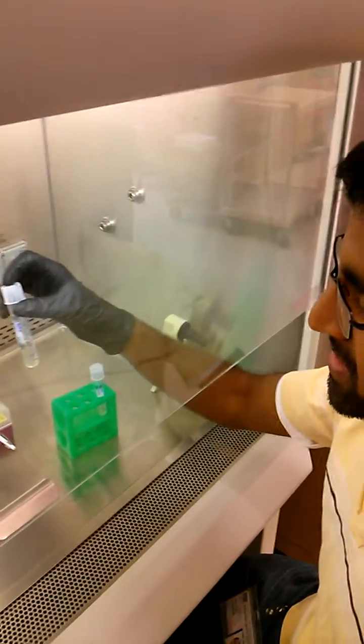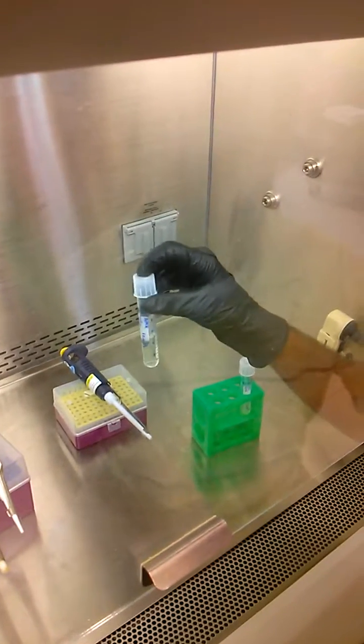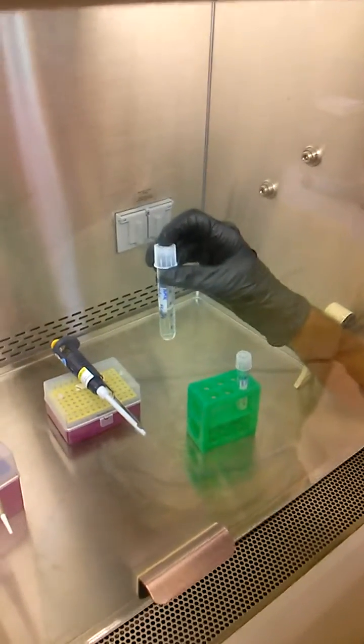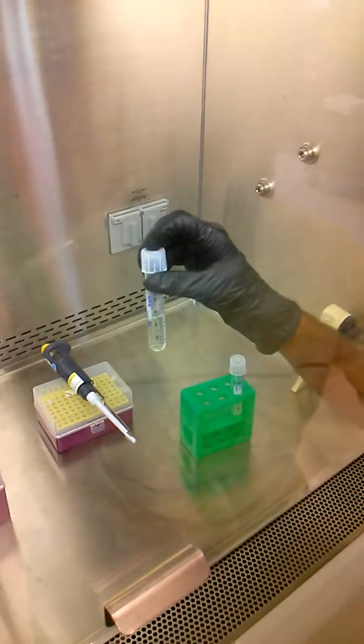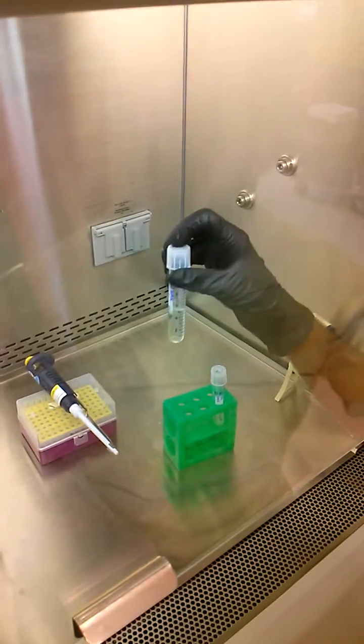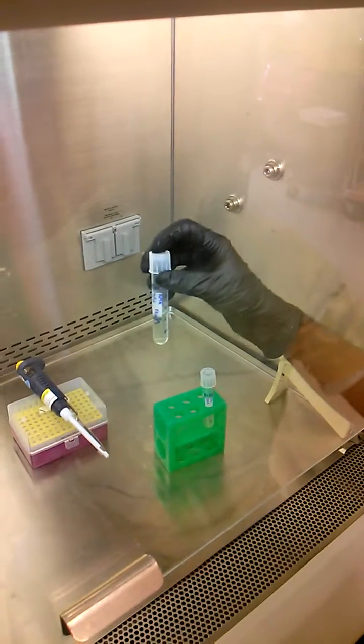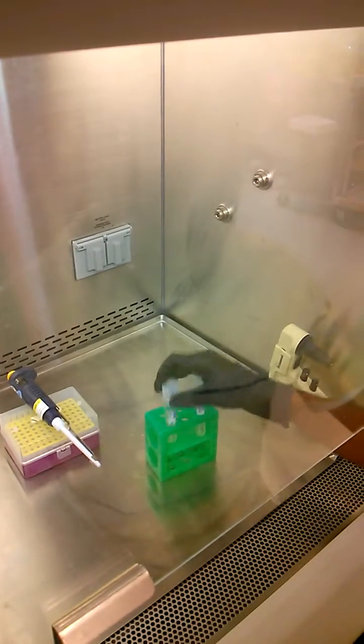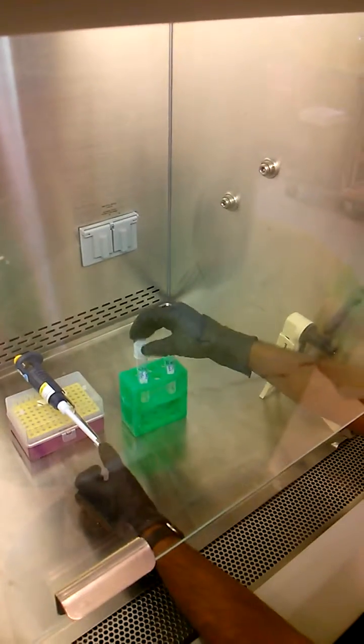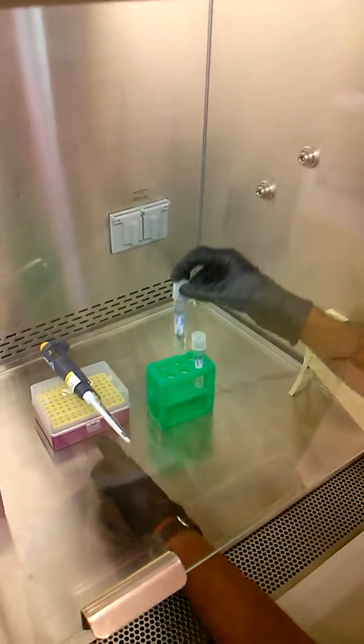So what I've done is I've already prepared five mils of LB broth with a little bit of glucose and some calcium chloride. The calcium is necessary for the infection to occur, and I also have the kan antibiotic in here.